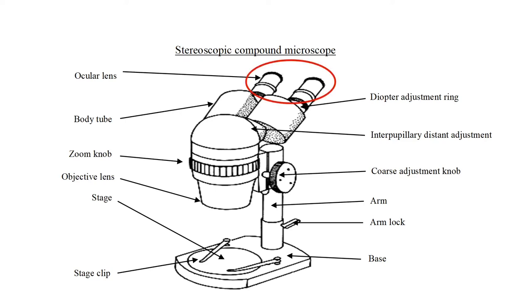This is ocular lens, objective lens, stage and stage clip, coarse adjustment knob, zoom knob, base and arm.